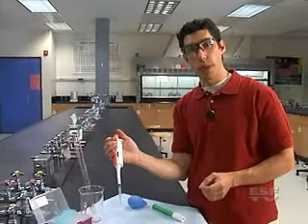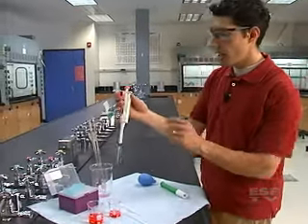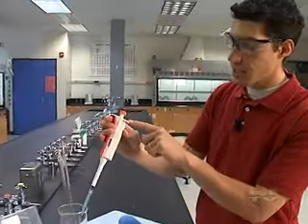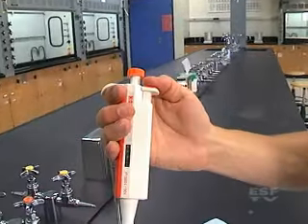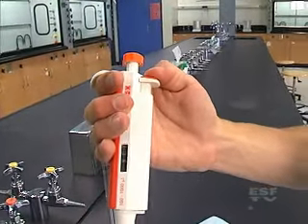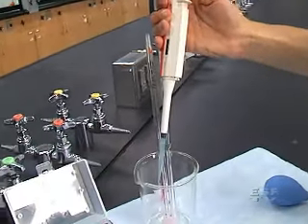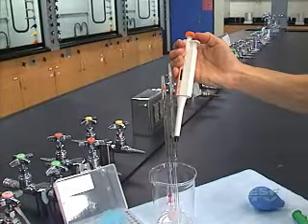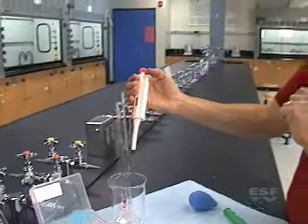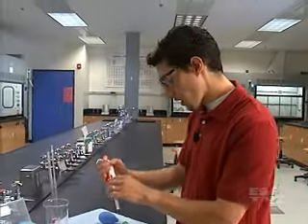When we're done with the micro pipette we need to get rid of the tip. That's done using this little dispensing lever. All you need to do is use your thumb to push down into your waste beaker, and it gets ejected from the tip — you don't need to touch it at all.